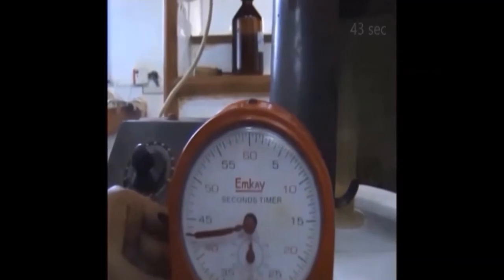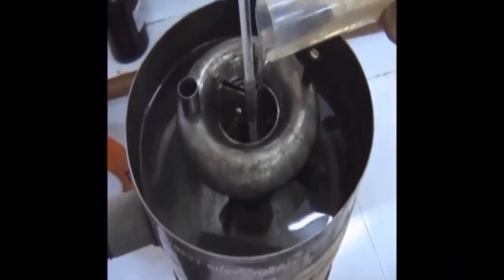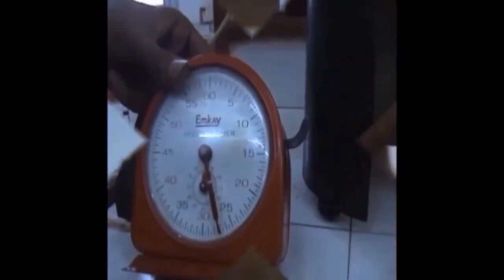need to start the stopwatch to measure the time it takes to fill the cylinder with 50 ml of the lubricant. Our first observation is 43 seconds. Refilling the vessel, we repeat this procedure for 50 degrees. Our second reading comes to be 27 seconds.